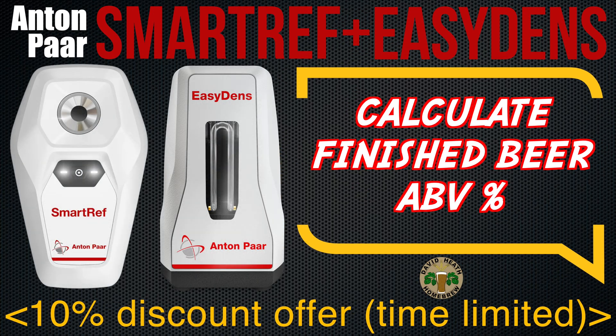Anton Parra have added a very interesting and useful new feature to their smart devices that, when used as a combination along with their smart app, will calculate the alcohol content of finished beer within a high level of accuracy. To celebrate this, Anton Parra are offering my viewers a limited time discount code that will give 10% when purchasing either or both devices. More on this at the end of this video. I will now be taking you through the process of using both devices to determine ABV of finished beer in easy-to-follow steps.